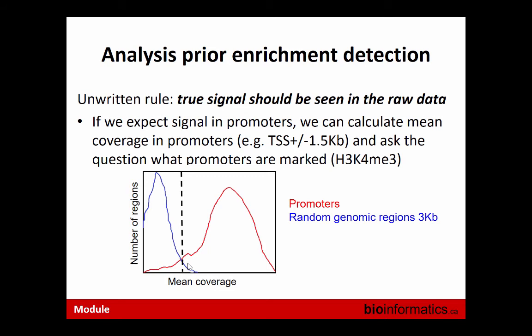So what I was just suggesting is the following. We can take a gene annotation system, like going to Ensembl or UCSC, and take all locations of the TSS of the genes. This will be this point, and 20,000 other points in the genome. I'm talking about coding genes. Take regions which are 3KB, and then calculate mean coverage, which will be the integral here divided by the size of this region, but the size is the same. For every gene, we have a number, c_i, and this i goes from 1 to 20,000.